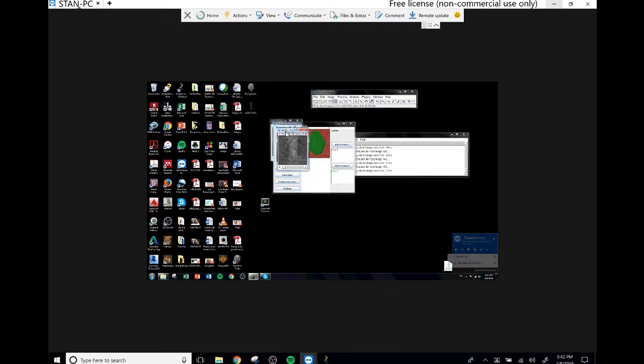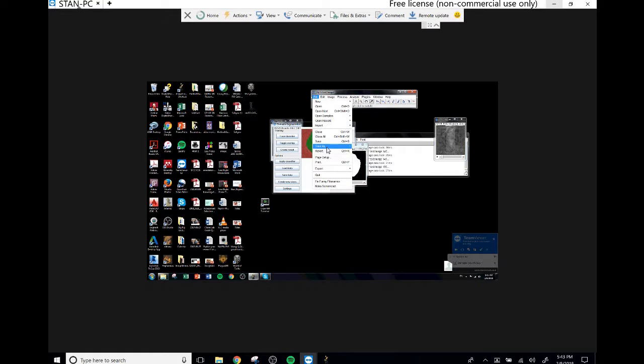And it's done, great. So here's the result. Let me scroll through it and there's the particle. Yep. Okay, so what I'm gonna do, I hate eating on the mic. There. What we're gonna do is load this back into my computer here so that we can see it better. So I'm gonna save it as a TIFF.